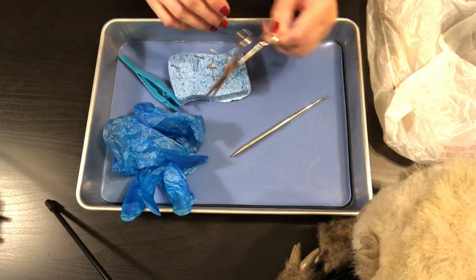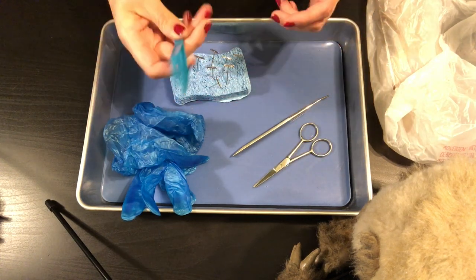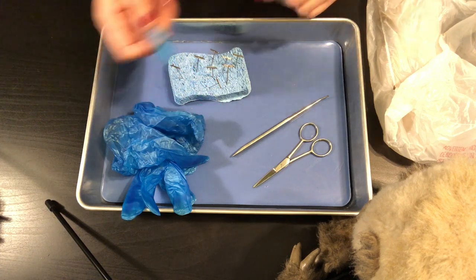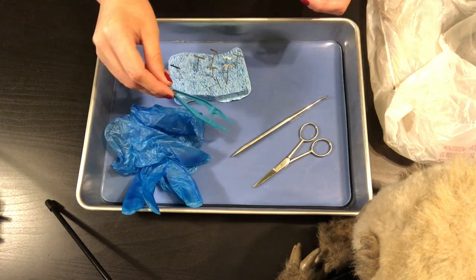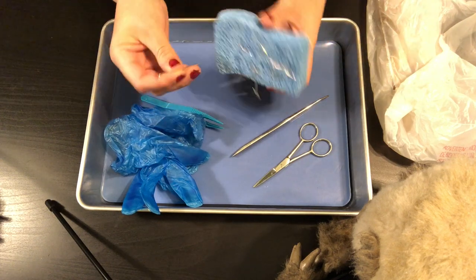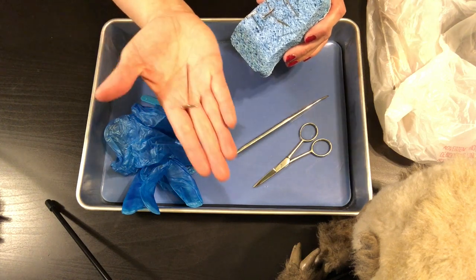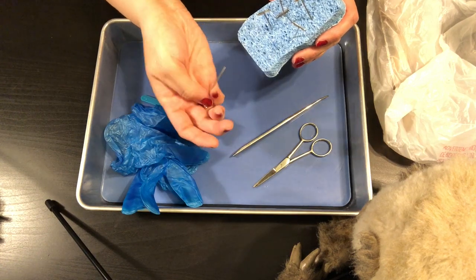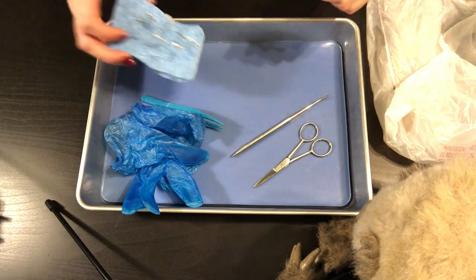We're not going to be using a scalpel — scissors are good enough to cut open our frog. We also have forceps, which are fancy tweezers. These are good to use when you're trying to be really precise, since stuff can be slippery with your gloves on. I also have dissecting pins stuck in this sponge for easy transport. A dissecting pin looks like a capital T, and we stick it into the frog to hold it in place.